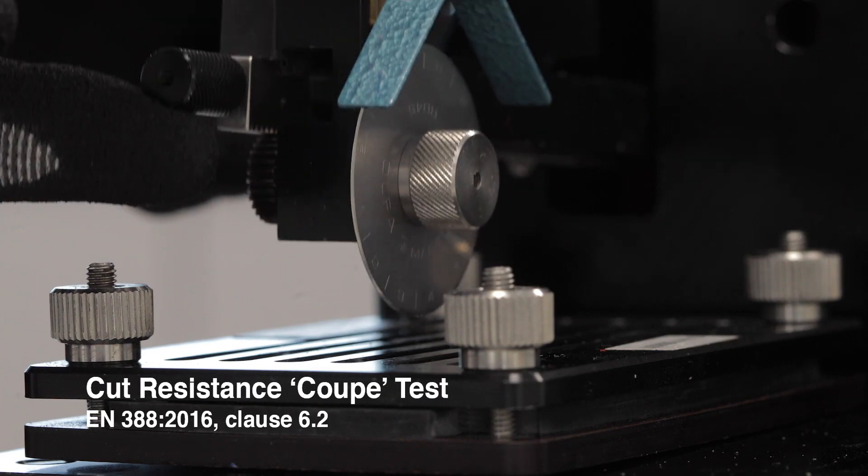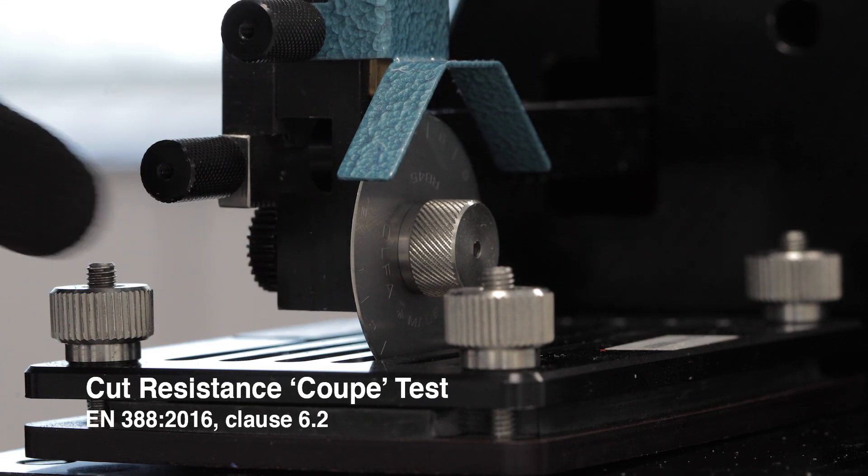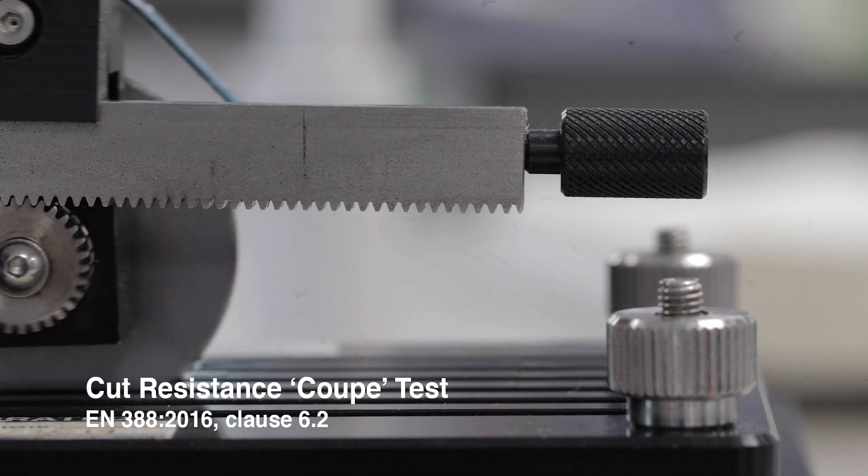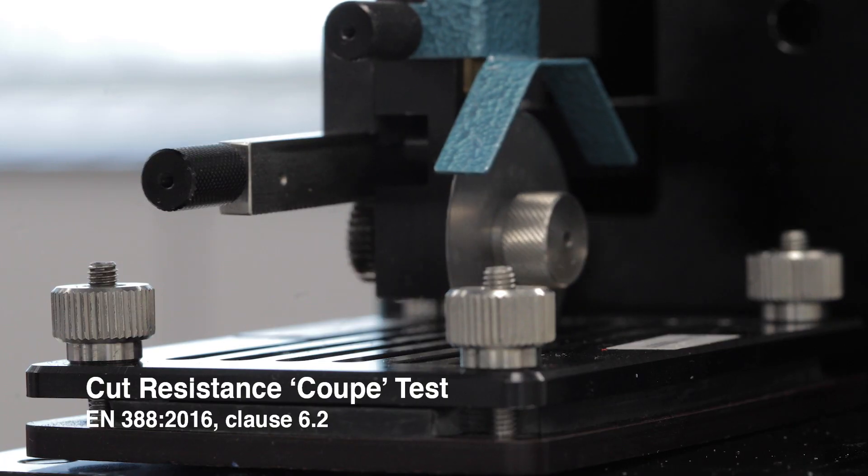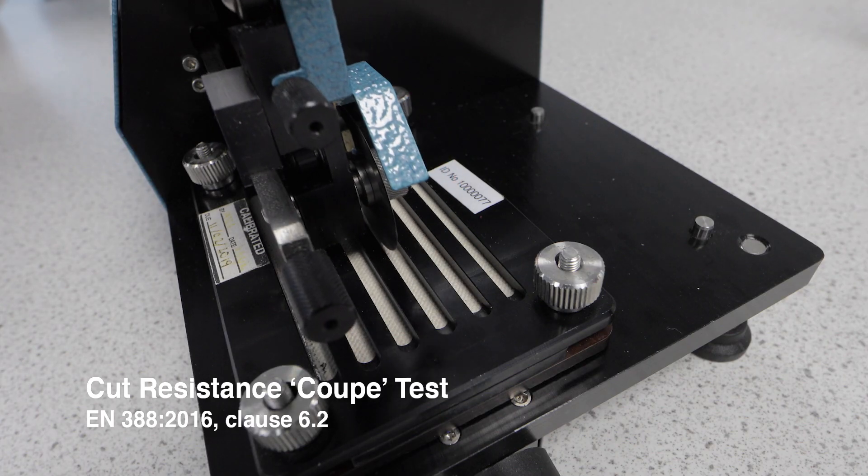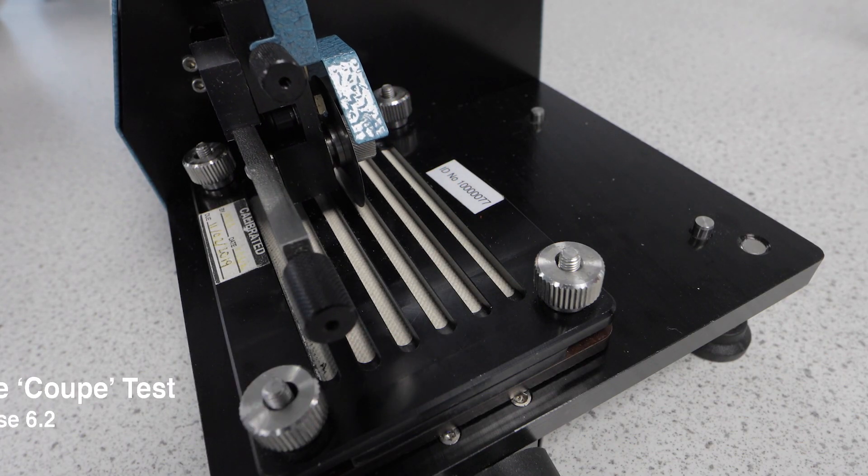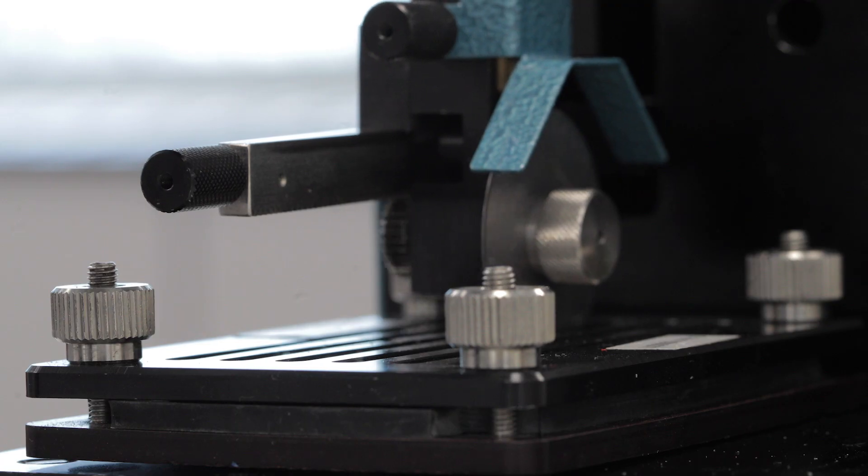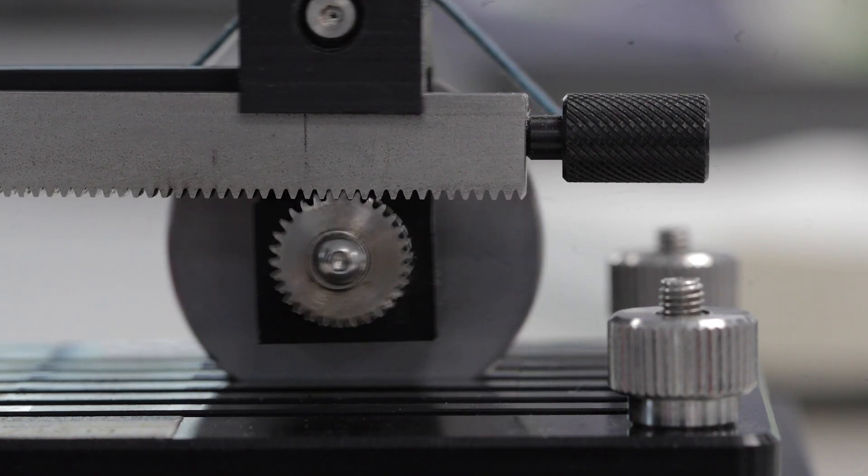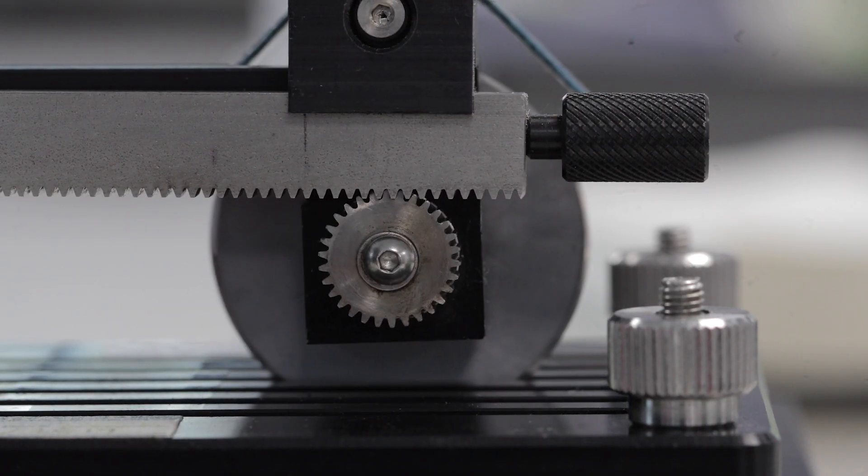The coupe test assesses how well gloves protect against sharp objects by counting the number of times a rotating blade moves back and forth over the fabric before it cuts through the glove sample.